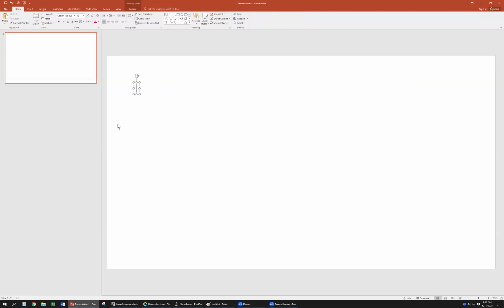Okay. So we write down again, the relative method. The first step is use the standard sample. Adjust the PeakForce QNM workspace.